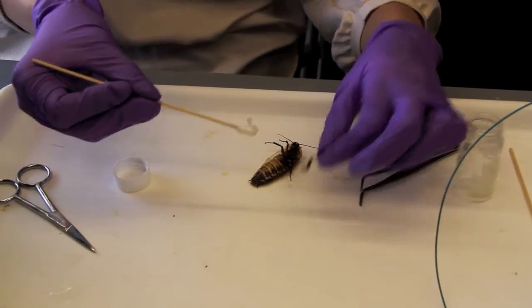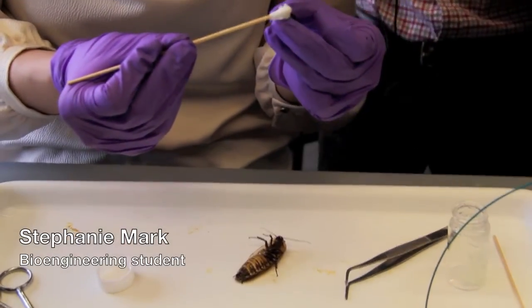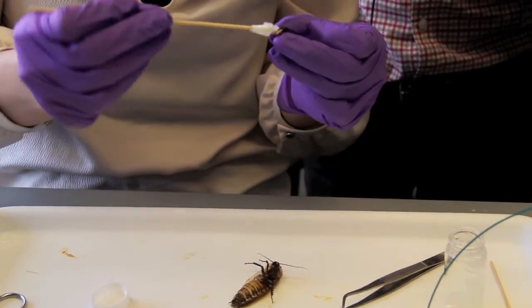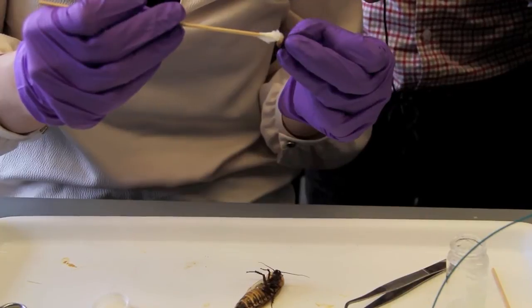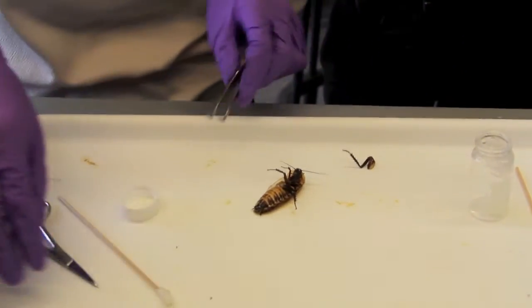I would say I've taken off about maybe eight legs so far. And sometimes the legs twitch just as a reaction, which is kind of unsettling, but I'm definitely less squeamish after this lab.